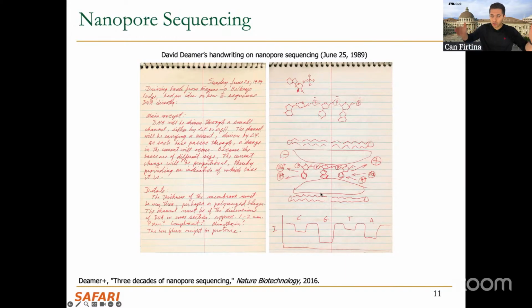Imagine your resolution is just so low that, for example, we would be taking a sample for every 10th base and so on. Whatever we have in between, we would be losing the information. And again, there is a variance of the speed and so on. So it was challenging early on.